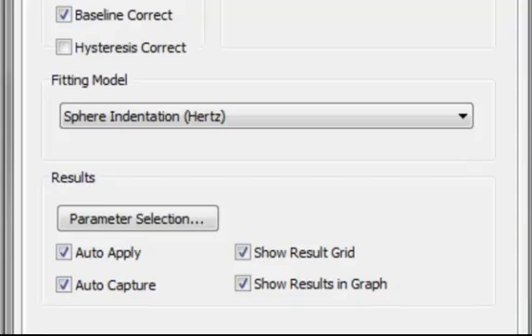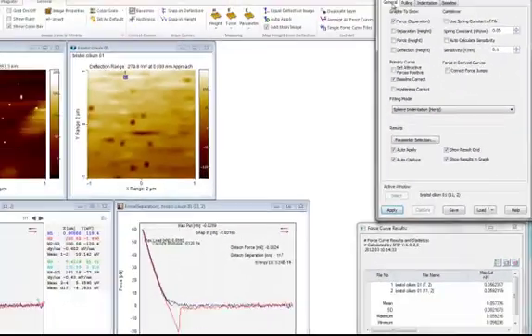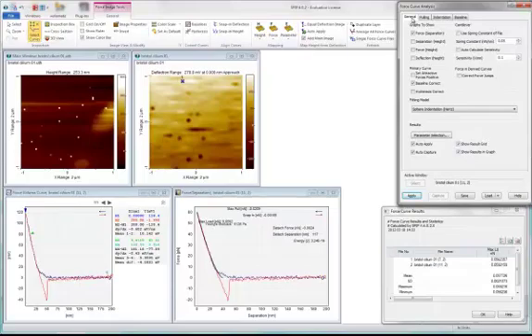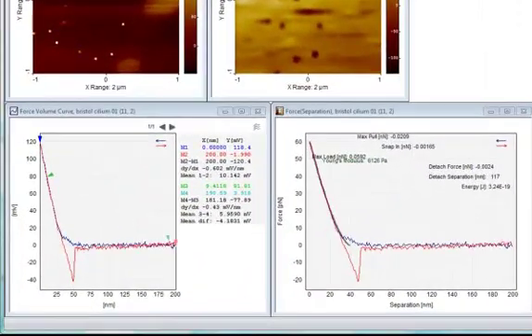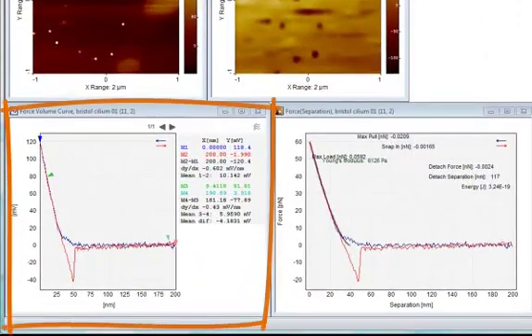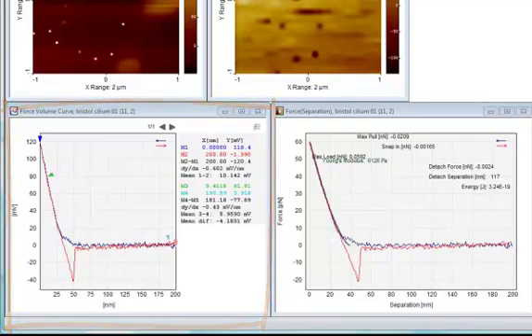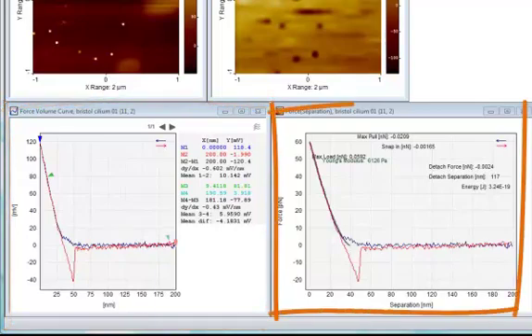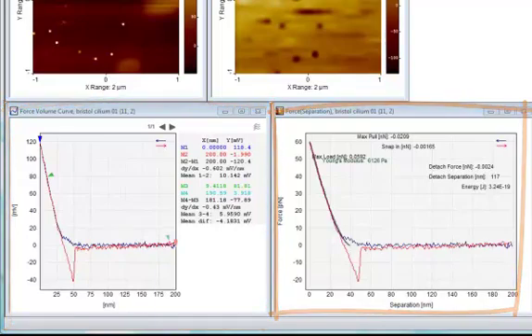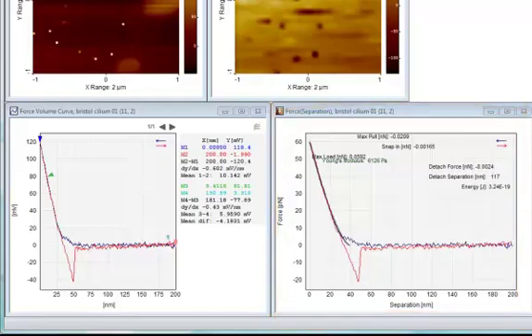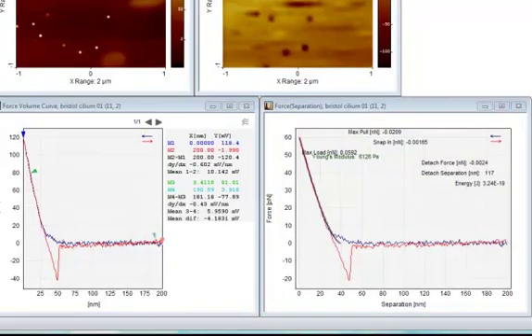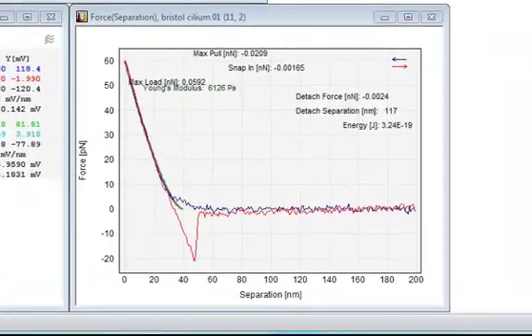Now let's zoom out and look at the curves generated by SPIP. First of all, SPIP displays the selected curve. In addition, we check the force versus separation option on the general tab. Therefore, SPIP also shows the force versus separation curve.